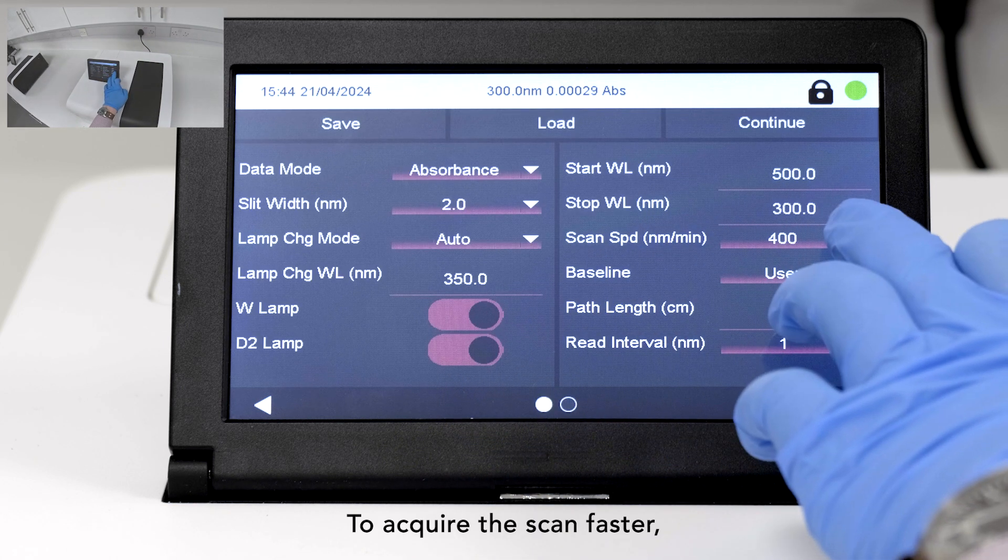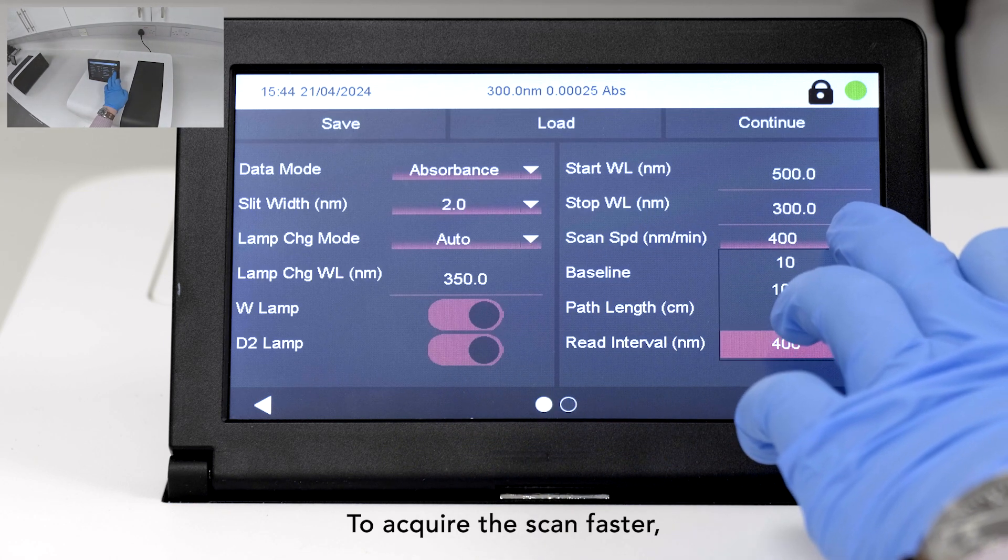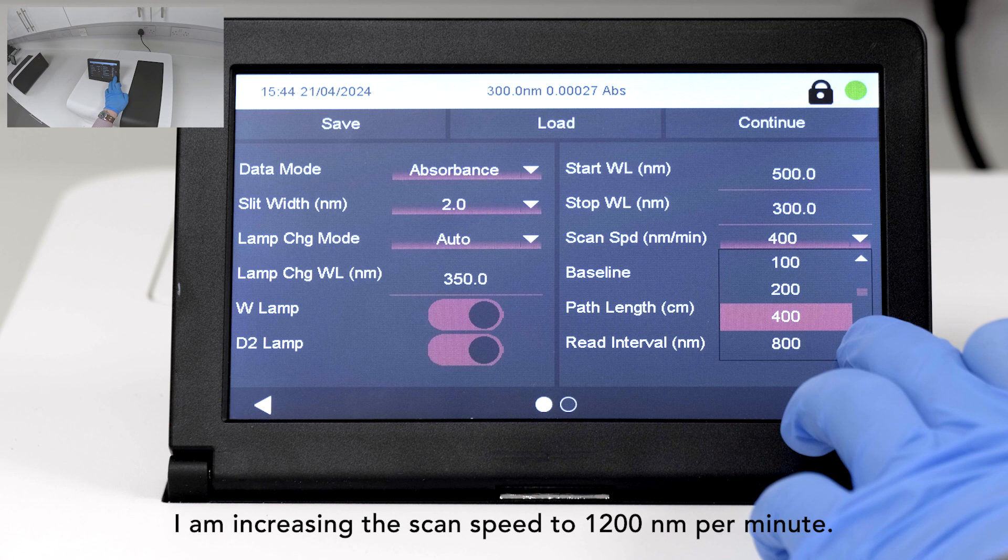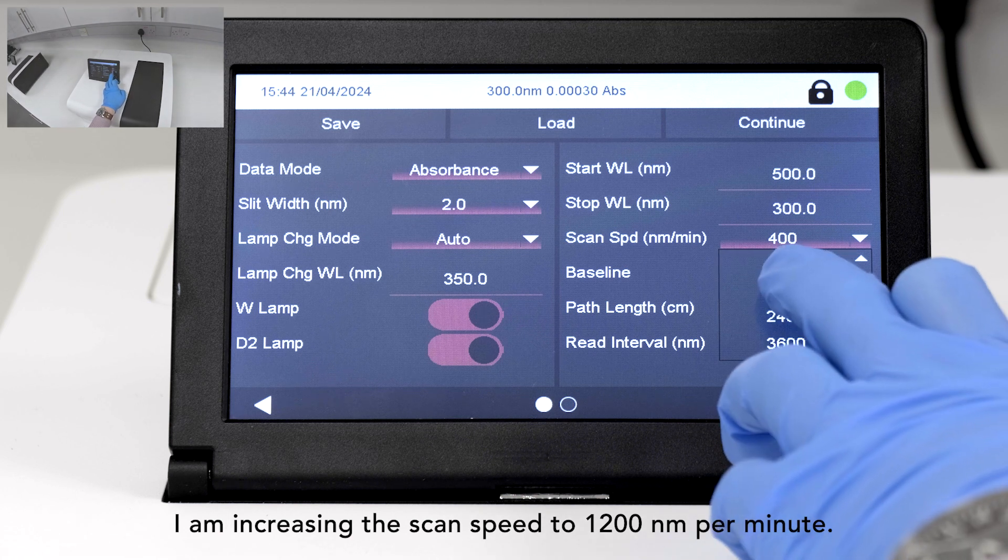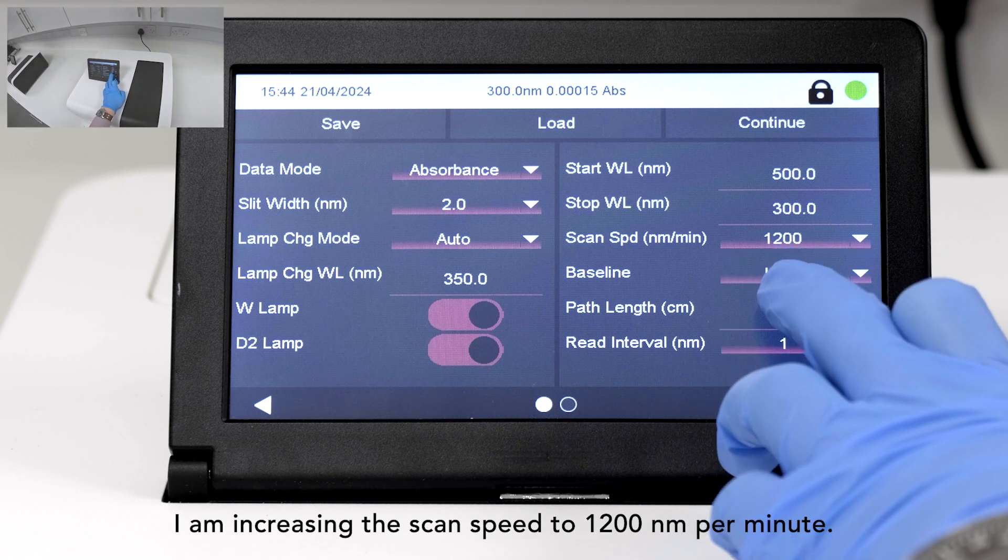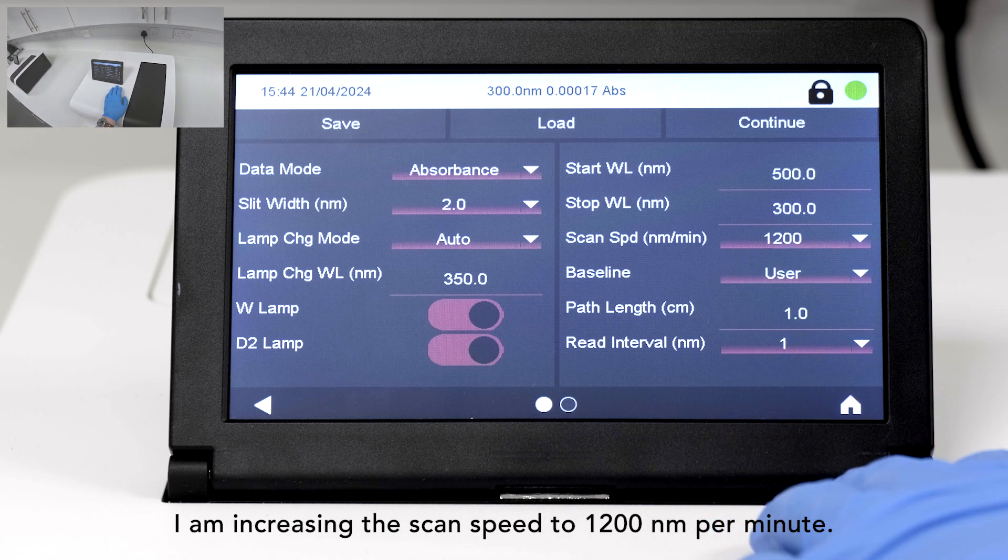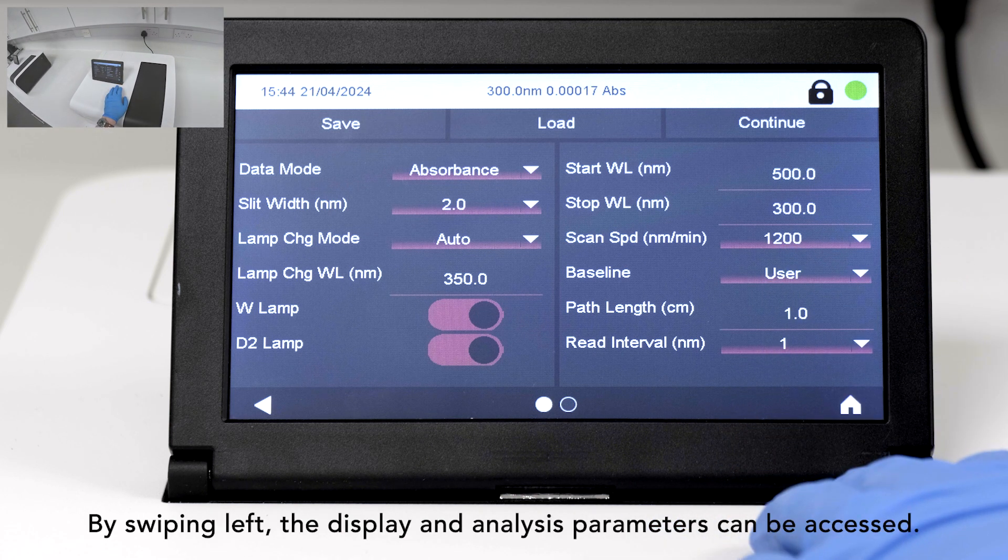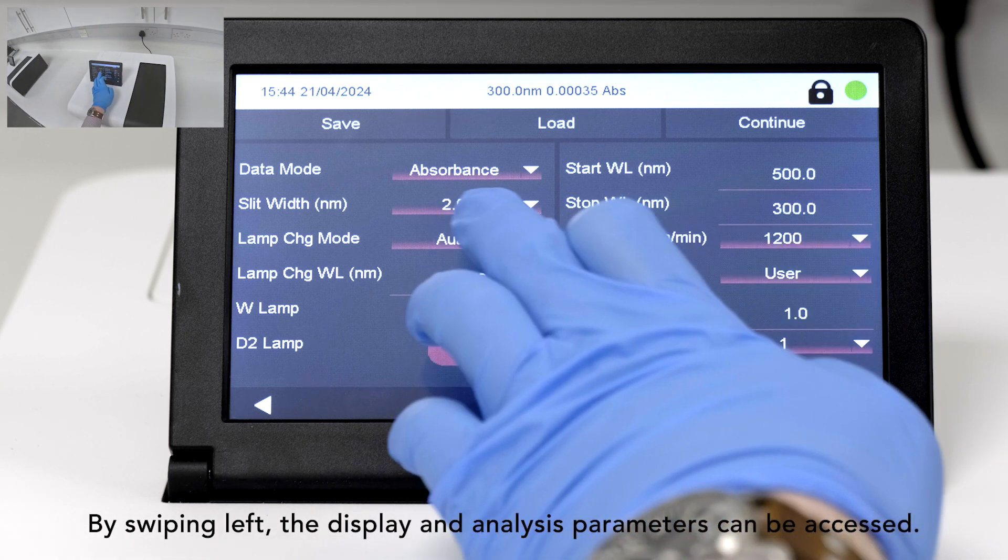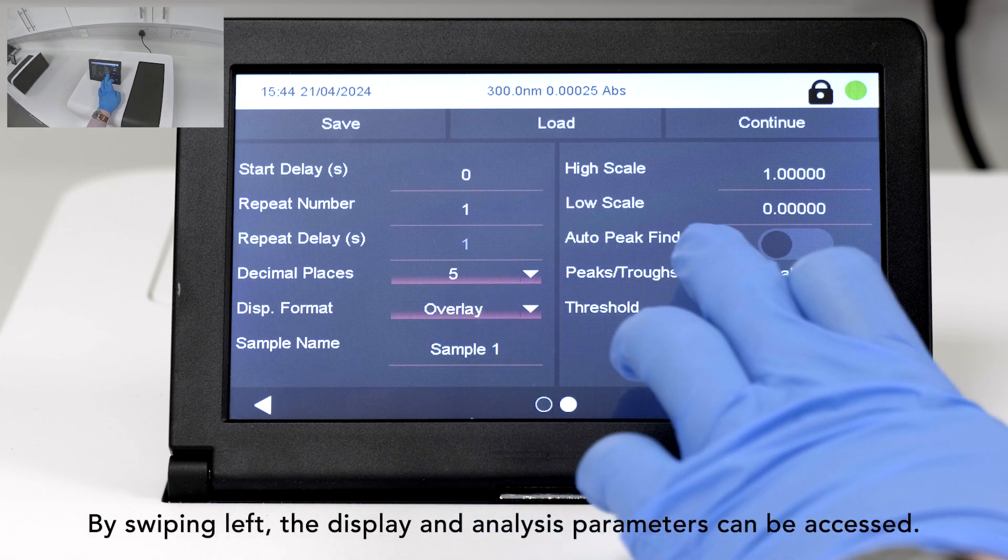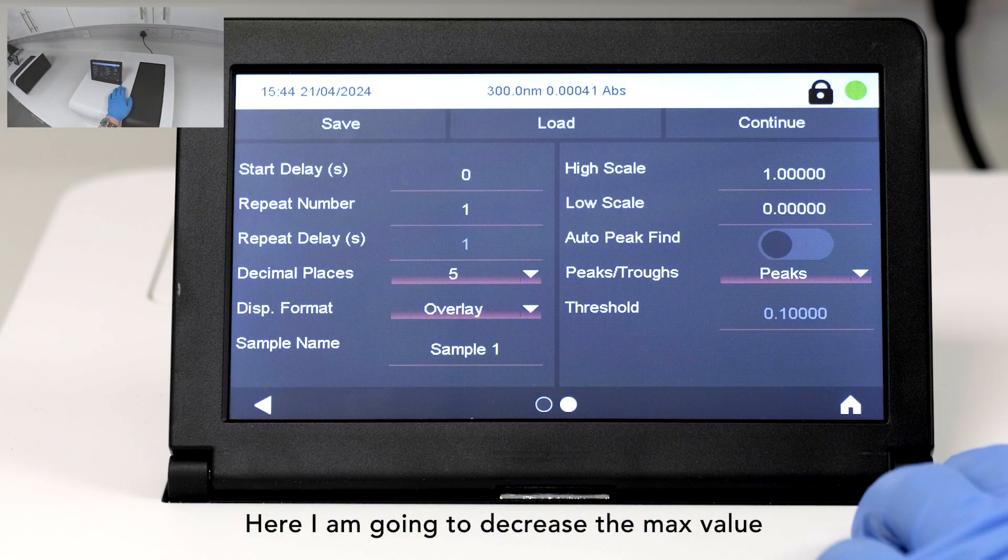To acquire the scan faster, I'm increasing the scan speed to 1200 nm per minute. By swiping left, the display and analysis parameters can be accessed.